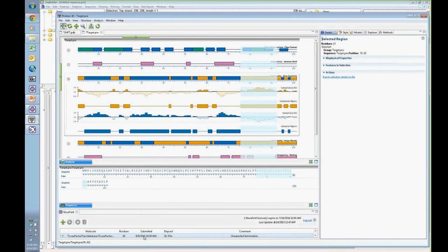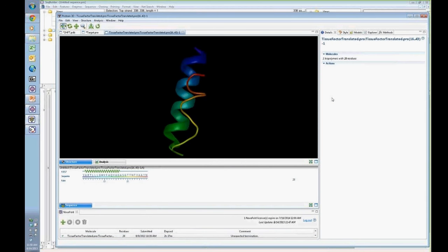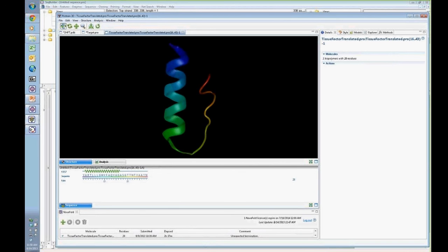So, for example, 28 very small residues, I've highlighted it, and I have generated a three-dimensional image of that selection. That roughly took like 3 hours. It's showing you the three-dimensional representation. So this will allow you to extrapolate: is this a hydrophilic protein? Where does it exist? What does it look like in the three-dimensional space? If you have a specific focused area of interest, where does that exist in that three-dimensional image, and so forth.